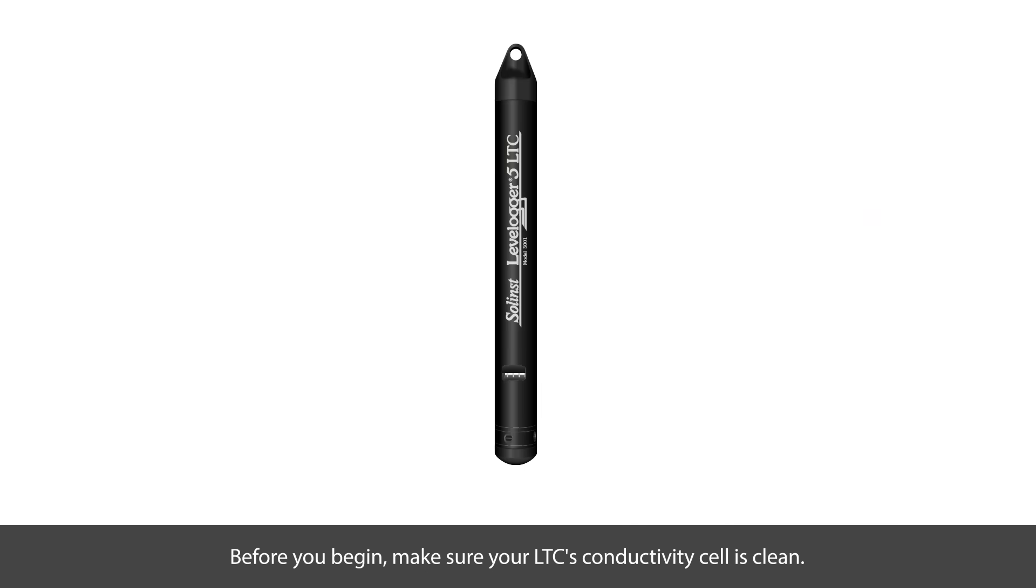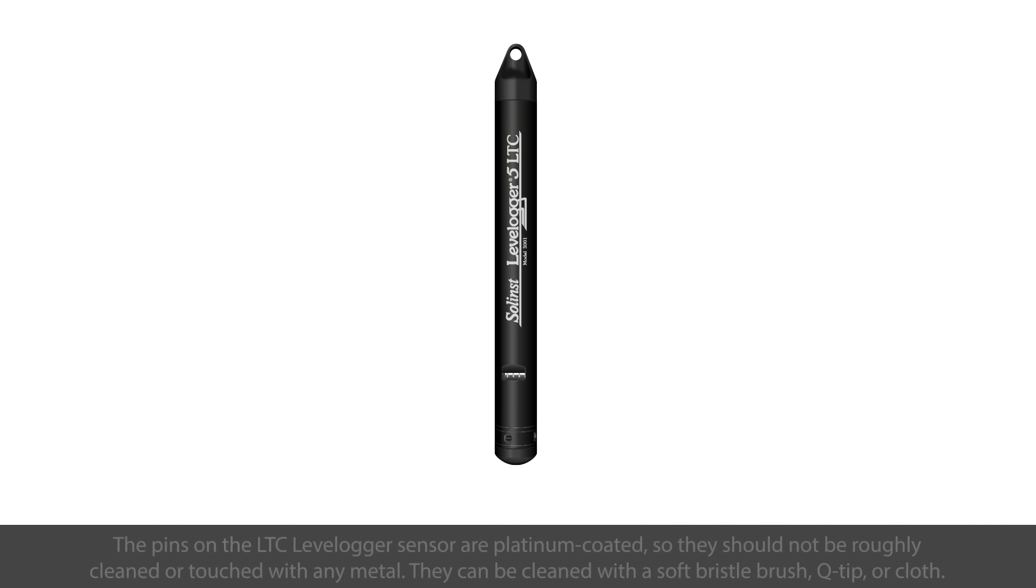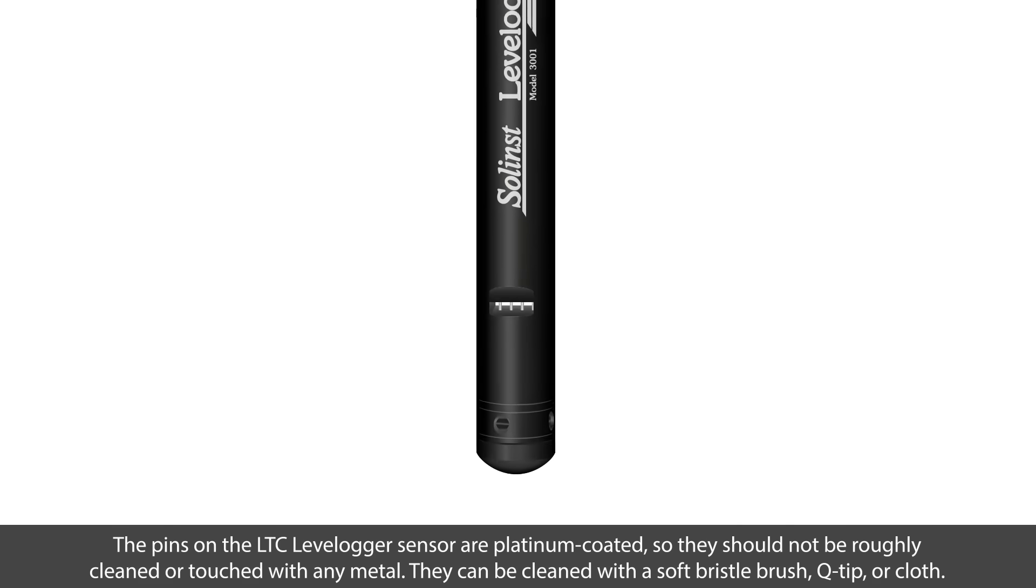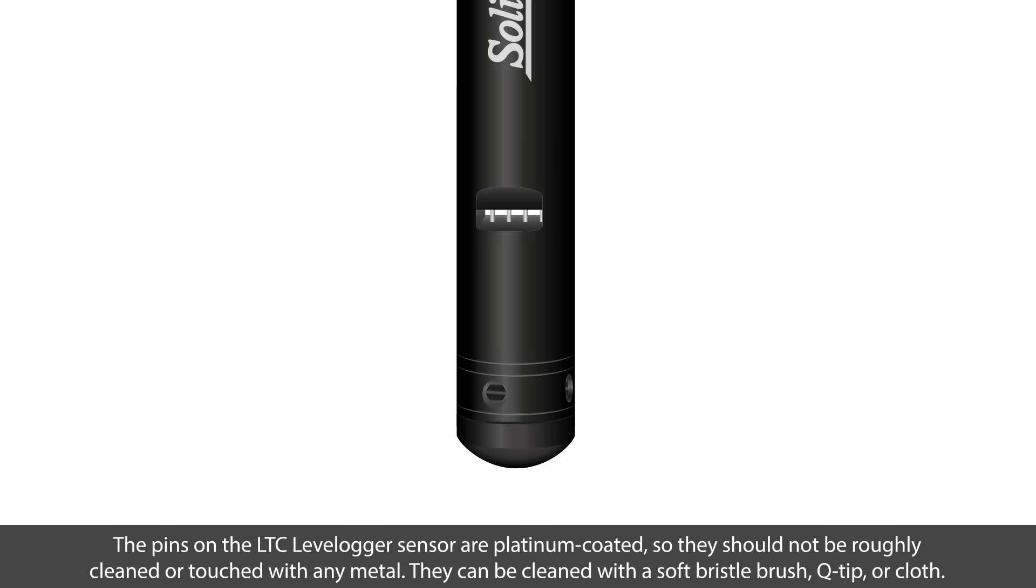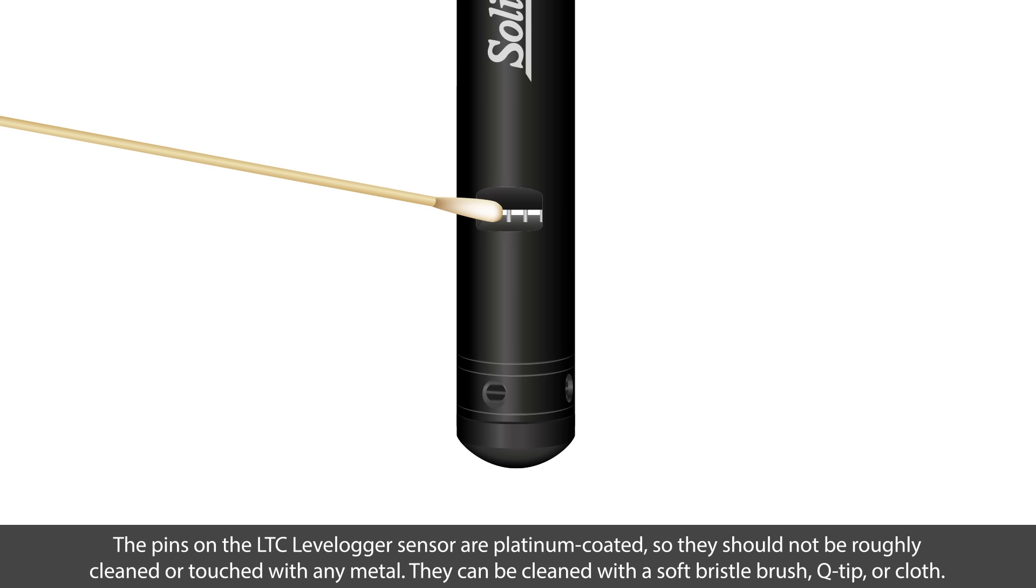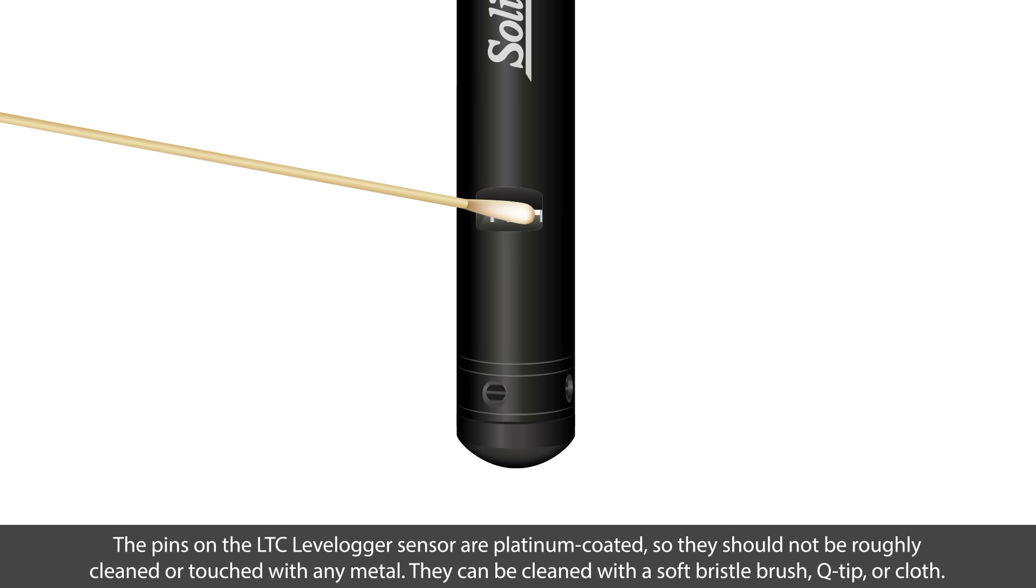Before you begin, make sure your LTC's conductivity cell is clean. The pins on the LTC LevelLogger sensor are platinum coated, so they should not be roughly cleaned or touched with any metal. They can be gently cleaned using a soft bristle brush, q-tip or cloth.